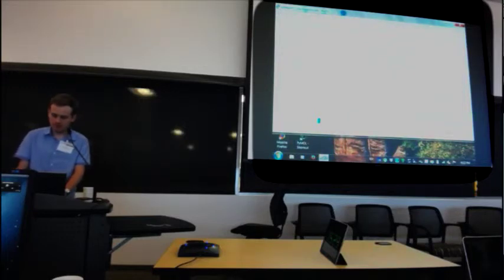Which we can then convert to an MTZ file. Do you use a reference? No. It's all raw data indexed by CrystFEL without any reference. And during the merging together, there's no option for scaling to a reference. So now, from the XSCALE file, you can very easily go to an MTZ file by xdsconv. I hope you are familiar with that.